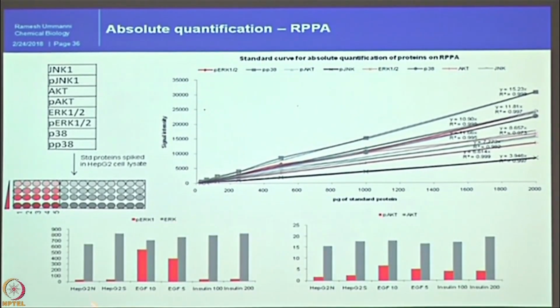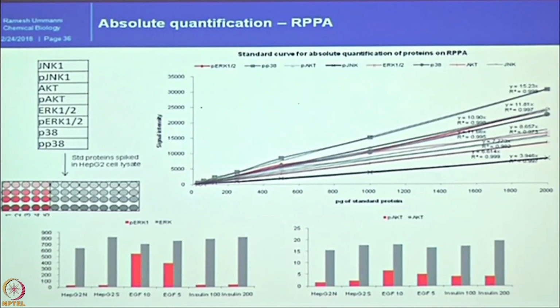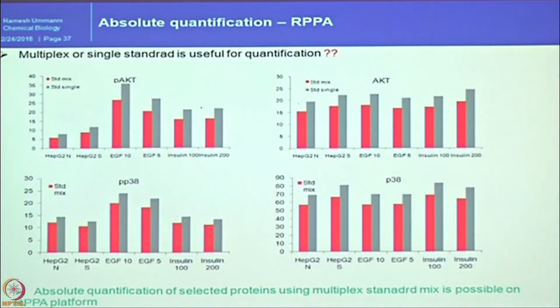looked at the signals detected here, different cell lines and different stimulated samples. We can nicely detect total values like this, and upregulated, downregulated copies are mentioned here. In a similar way for phospho-AKT and AKT here. I am sorry, the scales are different. Here it is times 10, here the total number is shown. So in this way, we can perform.